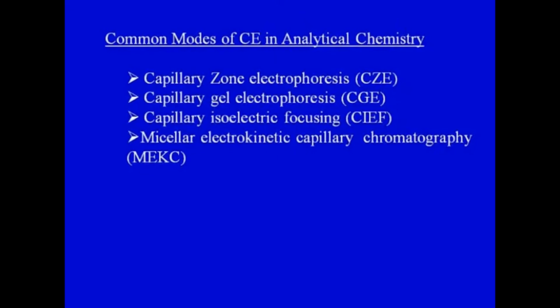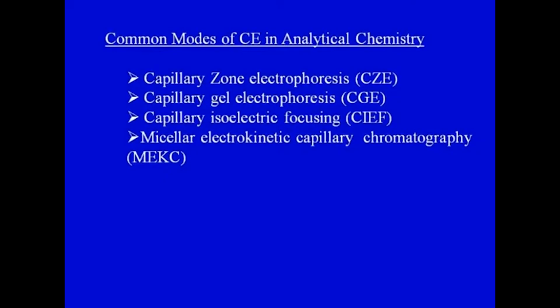There are many modes of capillary electrophoresis. There is capillary zone electrophoresis, where the experiment is done in free solution or free buffer. There is capillary gel electrophoresis, where a matrix material is packed in these columns.